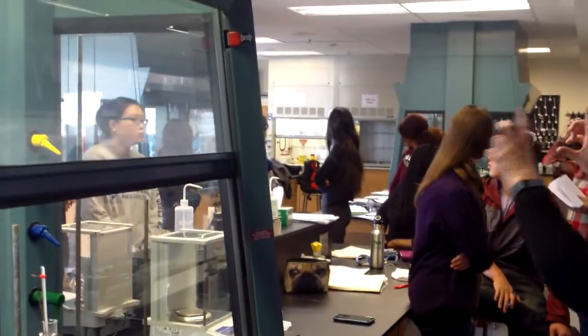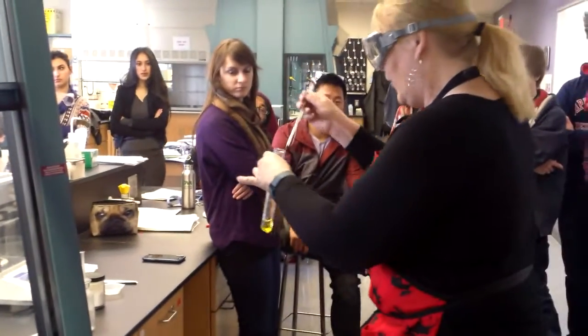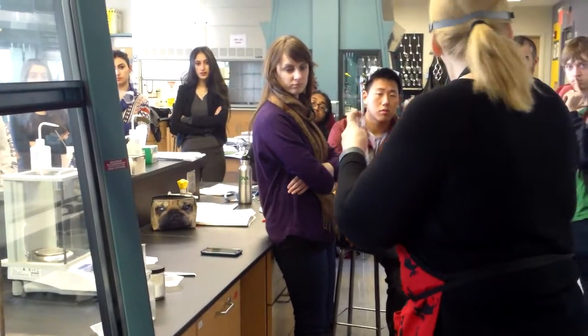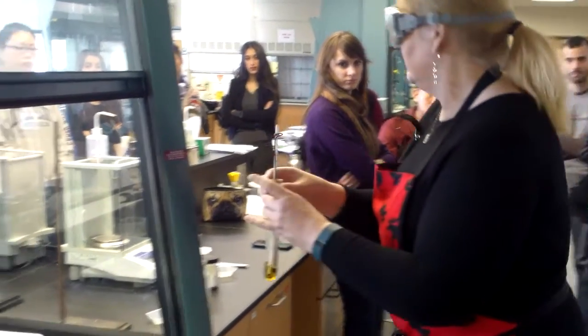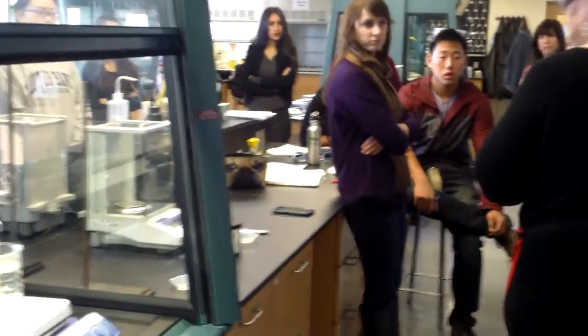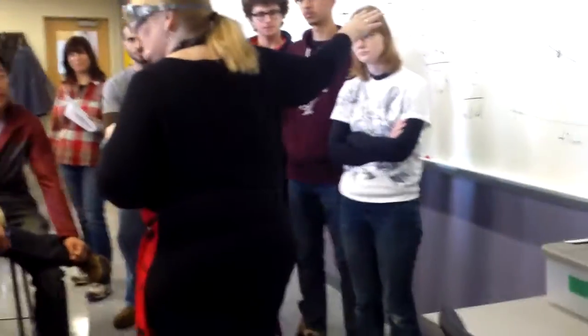It's going to be labeled hazardous waste for naphthalene. You are going to take your melted sample and you are going to pour it into the hazardous waste container, and then you'll rinse with small amounts of acetone to get the remainder out. Are we good? At that point, your experiment is done. Experiment is done? Good. Except your calculations are not done.